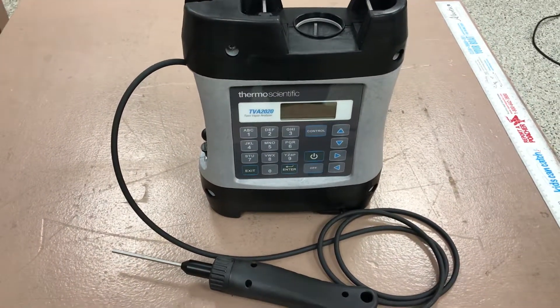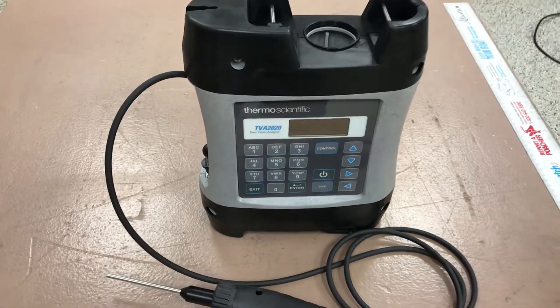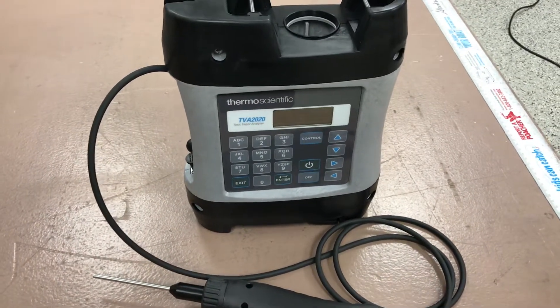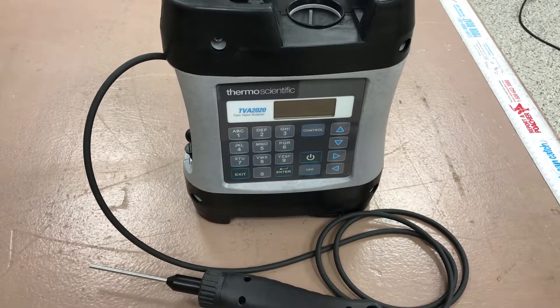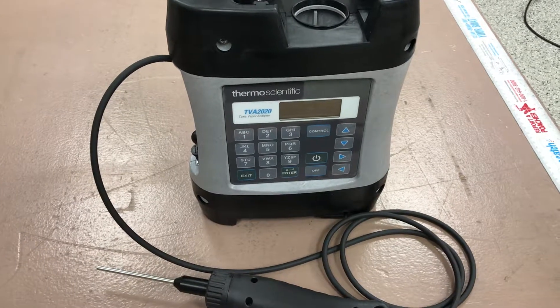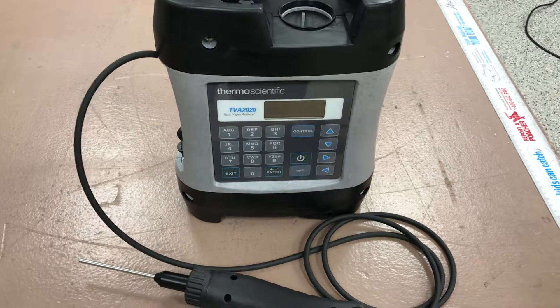They do routes along pipelines and valves, that sort of thing. This unit is the FID version. It can come configured with a PID (photo ionization detector), an FID (flame ionization detector), or both the PID and FID. This one is configured with the FID.